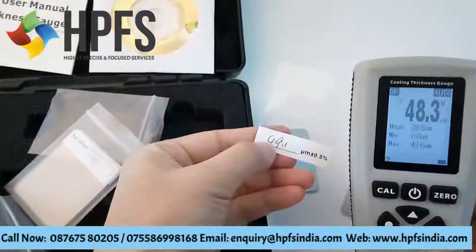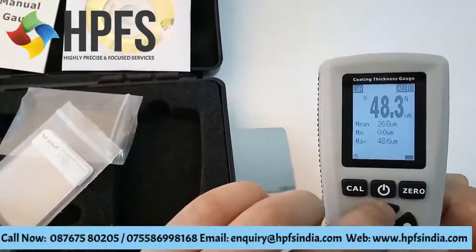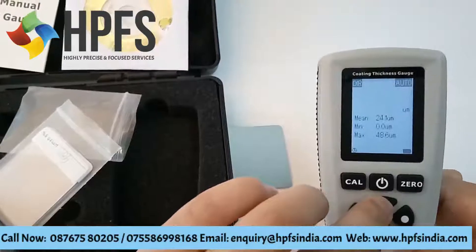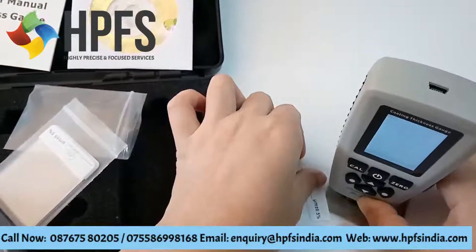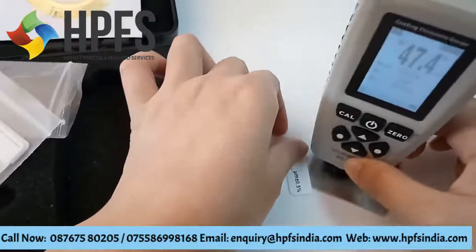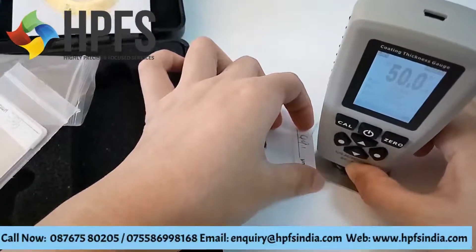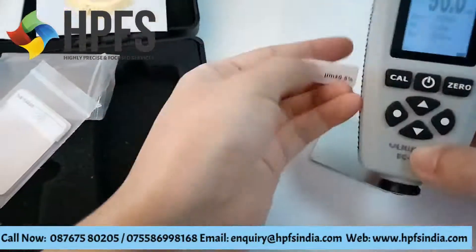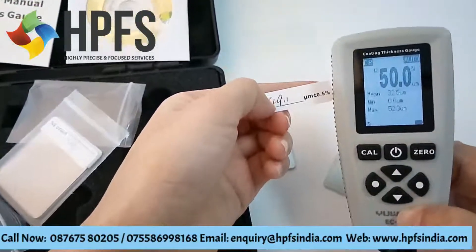If you think it is not close enough, you can adjust the point — add one. Now it's closer.